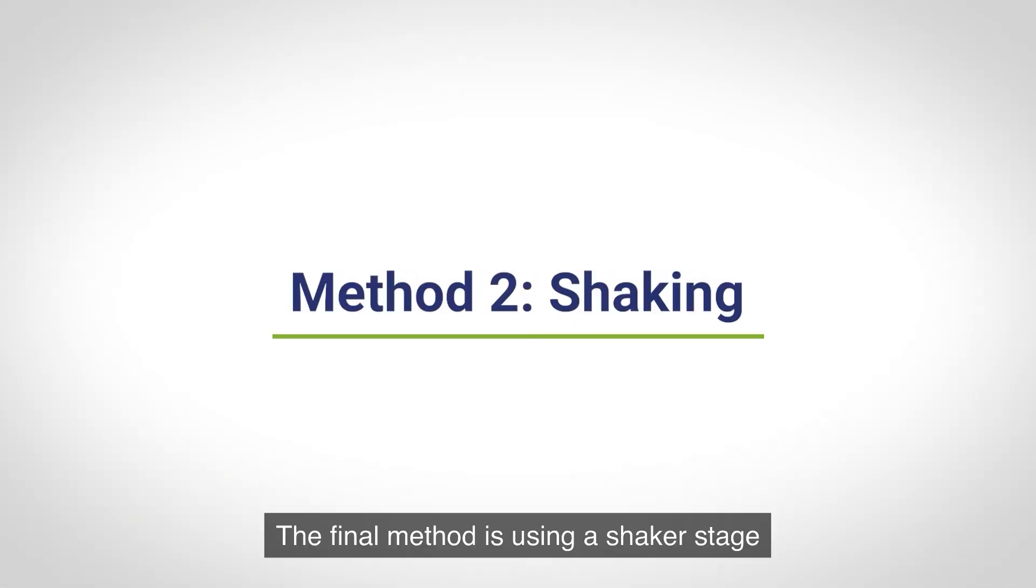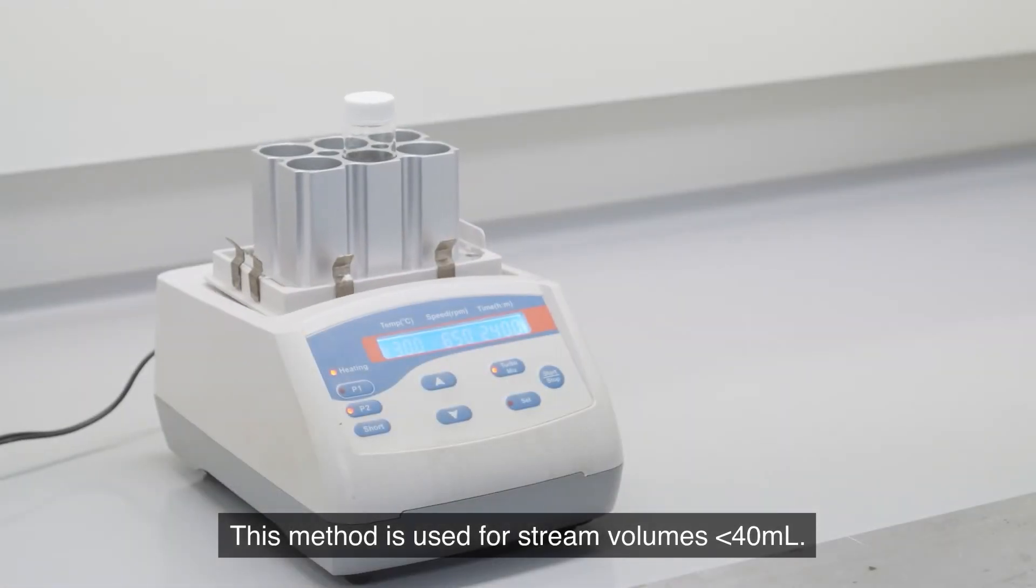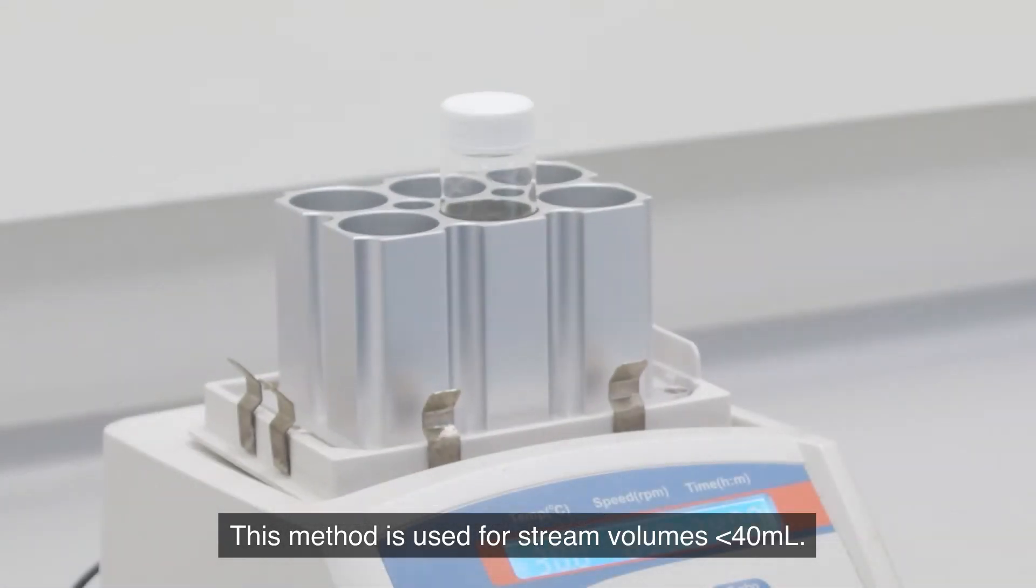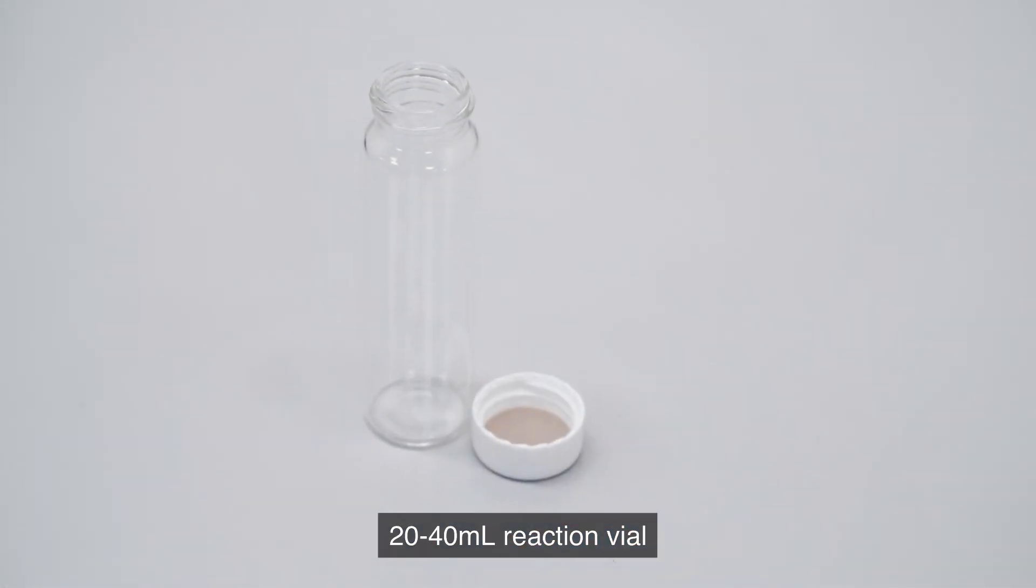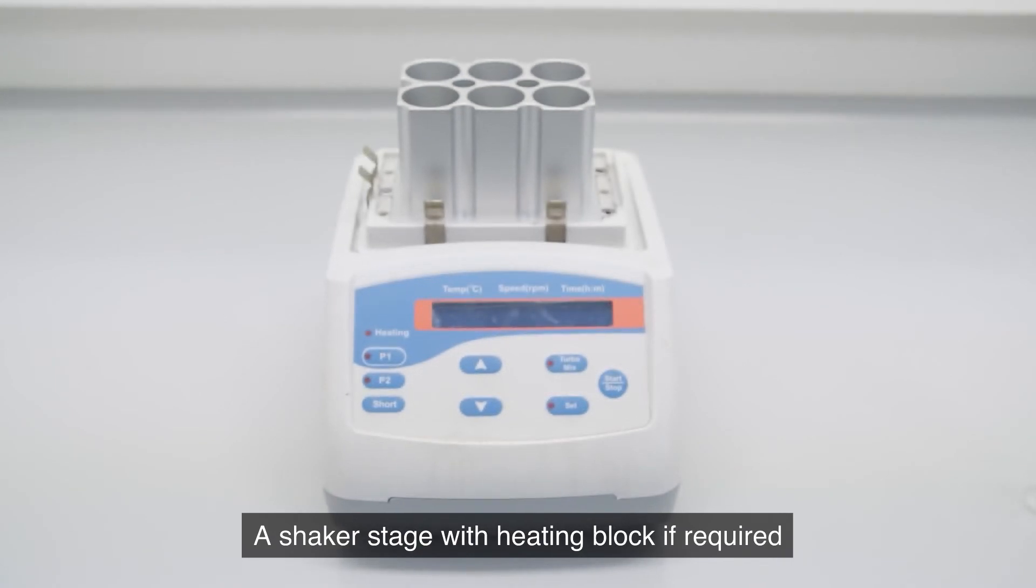The final method is using a shaker stage. This method is used for stream volumes below 40 mils. The equipment you will need is 20 to 40 mil reaction vial and a shaker stage with heating block if required.